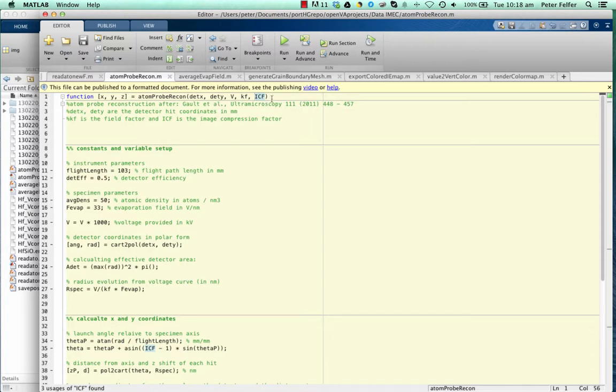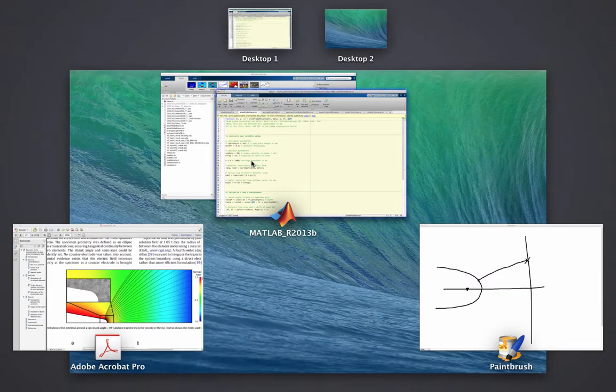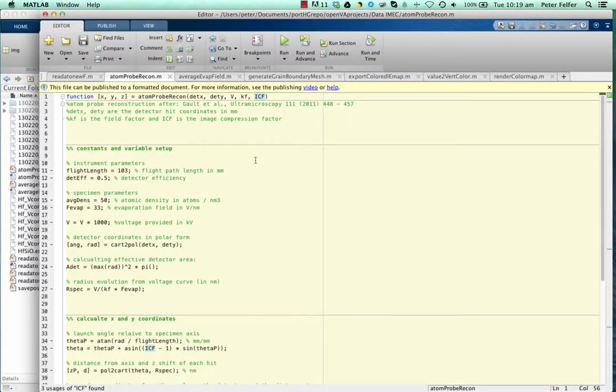So working on these reconstruction parameters is something that's a challenge right now, and not just the reconstruction parameters, but also some of the things here that I assume to be constants and may not be constants. Anyway, so what do we need for the reconstruction?